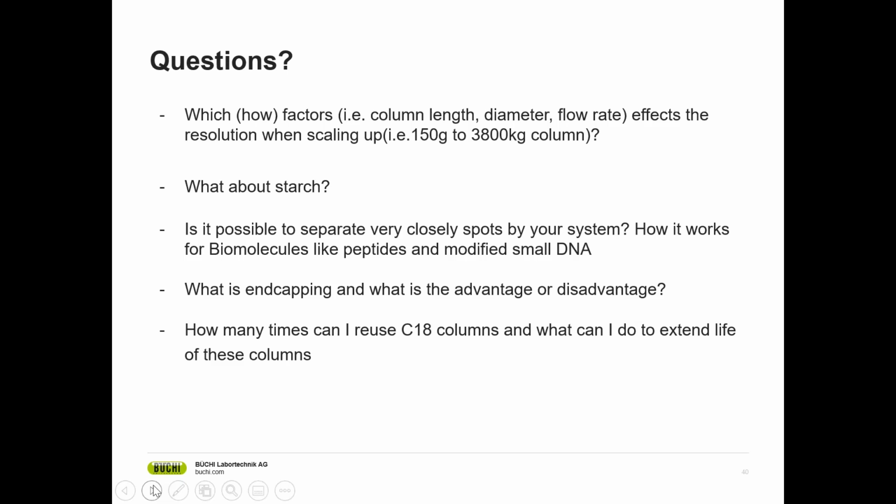If the molecules get bigger, the peptides get bigger, it is worth going for the C18 wide pore, which enables better retention for the larger molecules, because these larger molecules fit inside the pores and therefore have better retention. And if they're really close together, there is no way around using a prep HPLC column, preparative HPLC columns, for these separations. And here we go for C8 or C4 stationary phases, as they typically have better performance for larger molecules.